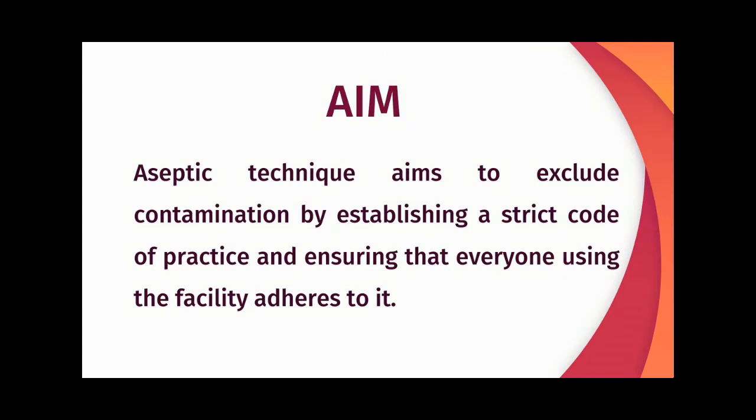Let us see the aim of this topic. Aseptic technique aims to exclude contamination by establishing a strict code of practice and ensuring that everyone using the facility adheres to it.